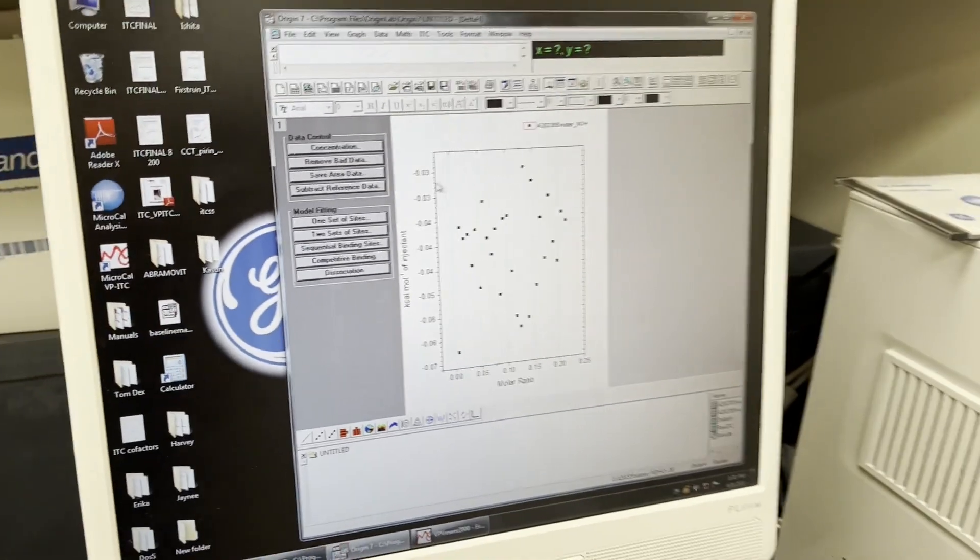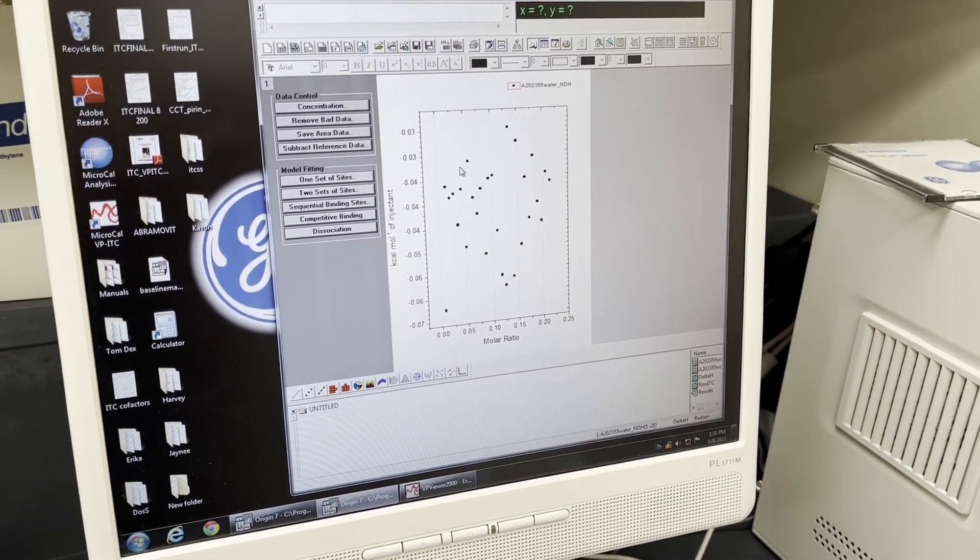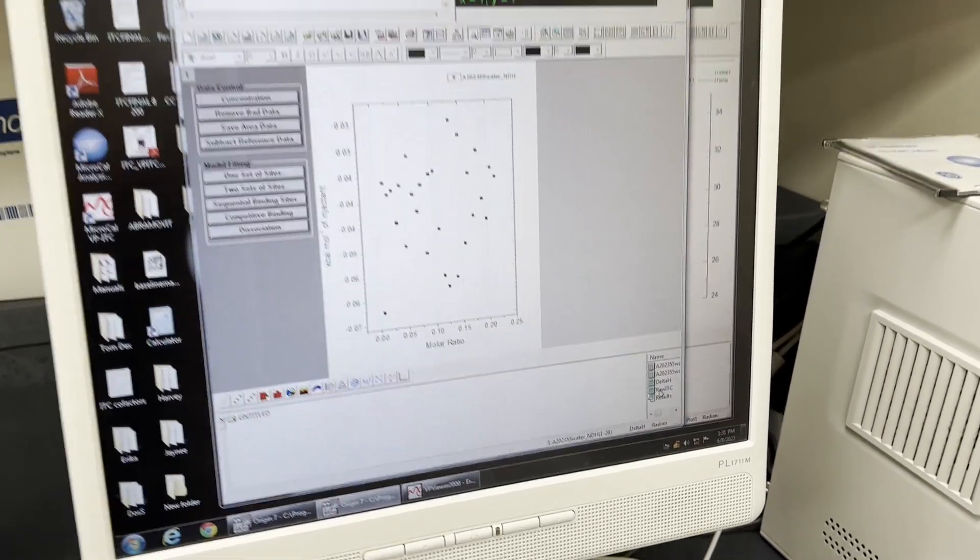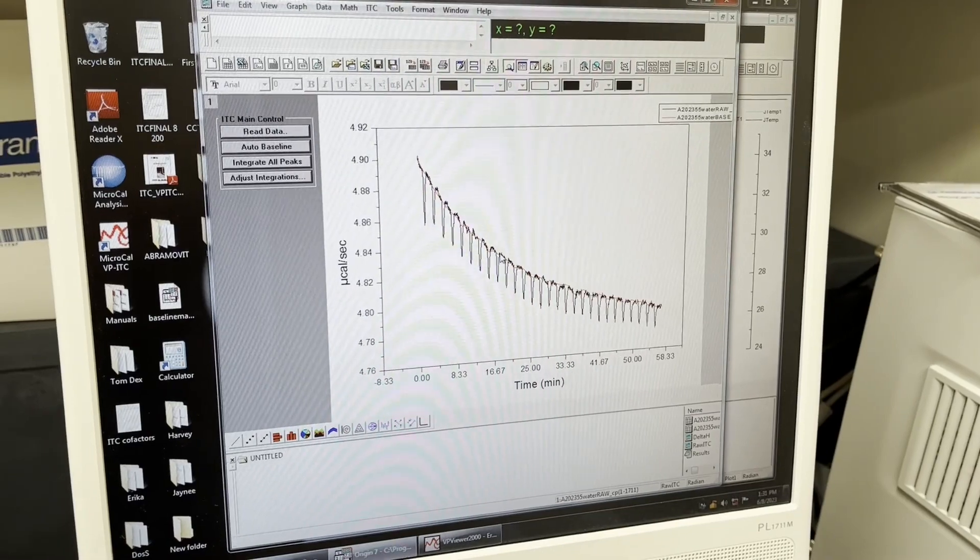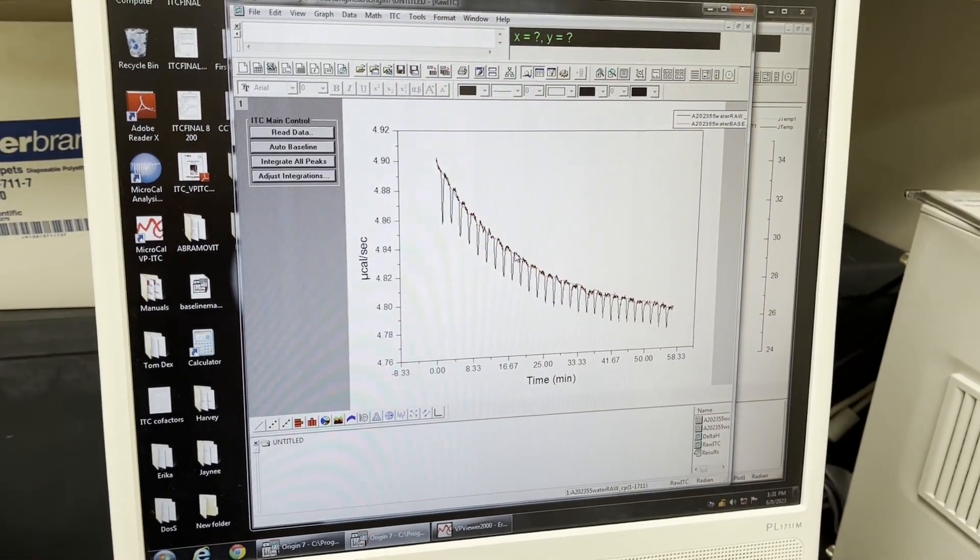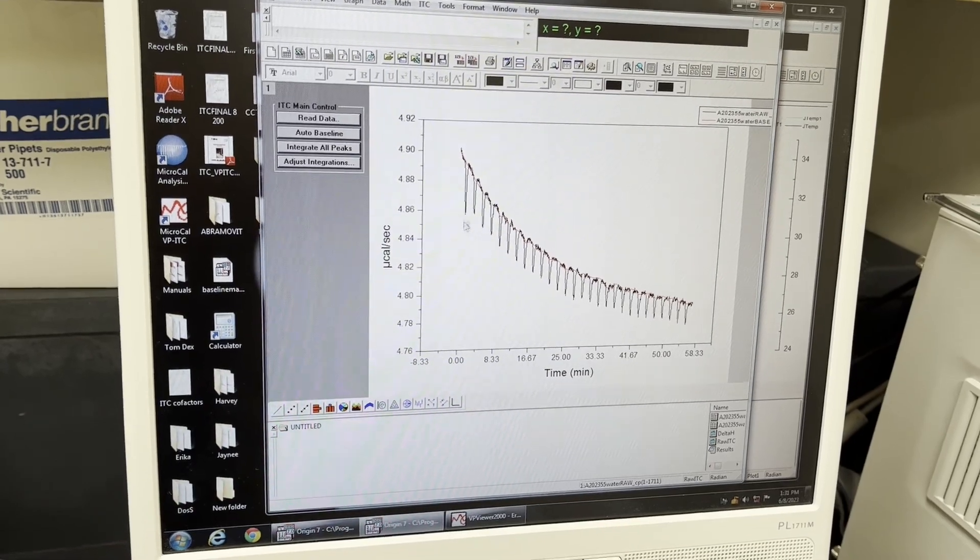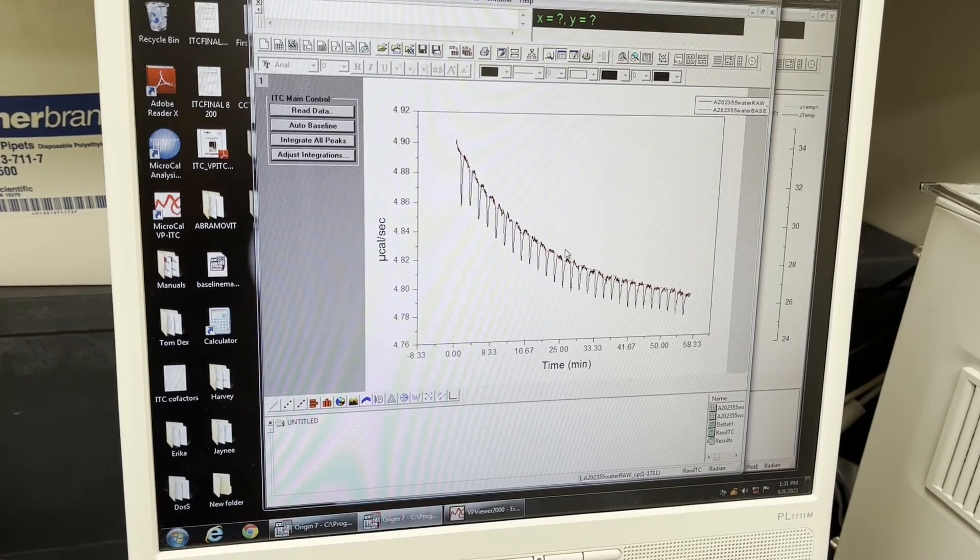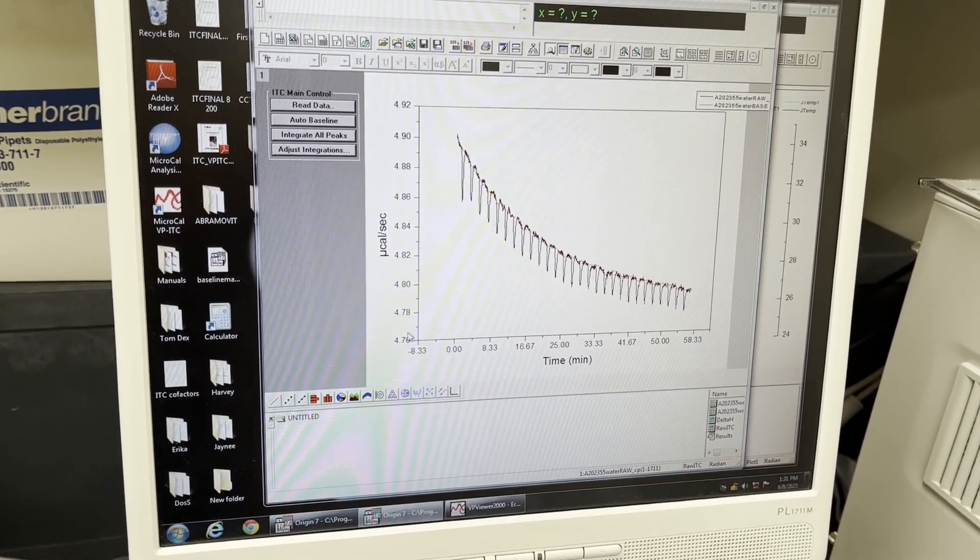This is the kcal per mole of injectant. If you would like to see the raw ITC values, you can see this is very zoomed in because we would not expect big changes in enthalpy with water water. You can see yes there's a little bit of a baseline drift but these are pretty small. Hopefully if you see real interaction this data would be much bigger.